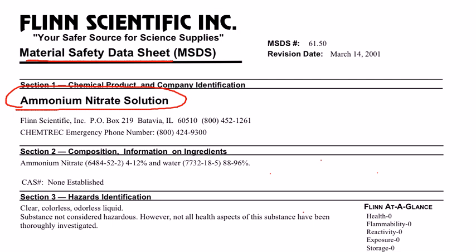The first thing you're going to notice is that it illustrates the composition of the solution. Since this is a solution, it tells you that you're going to find between 4% and 12% ammonium nitrate, and the rest of the solution is going to be water.